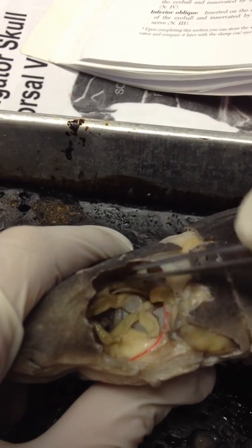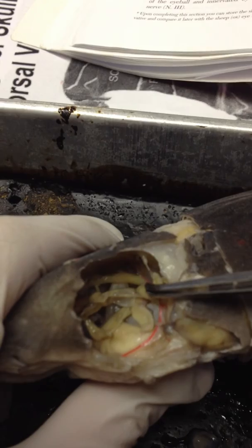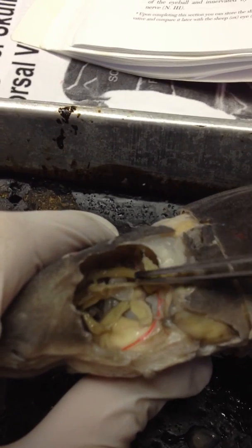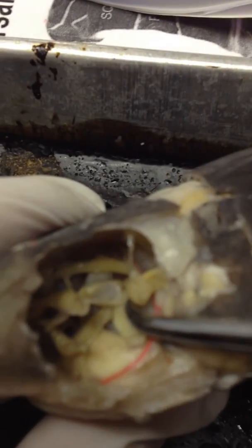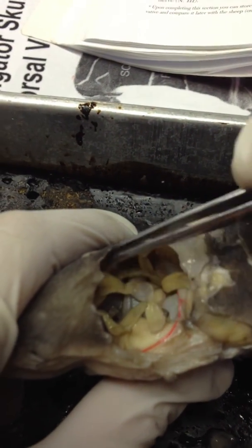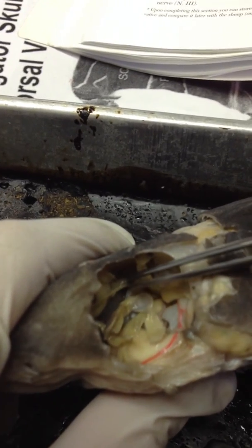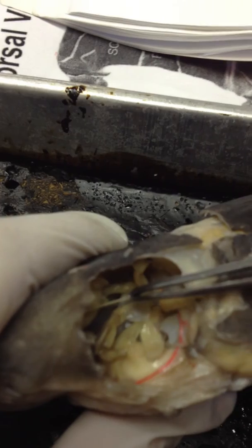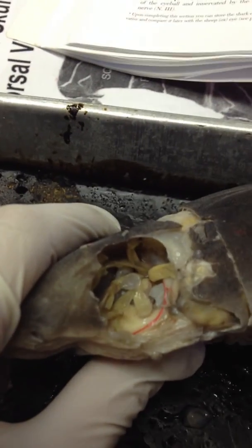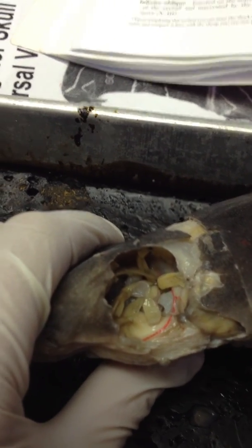The thicker nerve underneath that runs along the back is called the superficial ophthalmic nerve. The one that is thin and runs in front is the deep ophthalmic nerve — this thin one right here. And that covers all of the nerves you need to be responsible for in the dogfish.